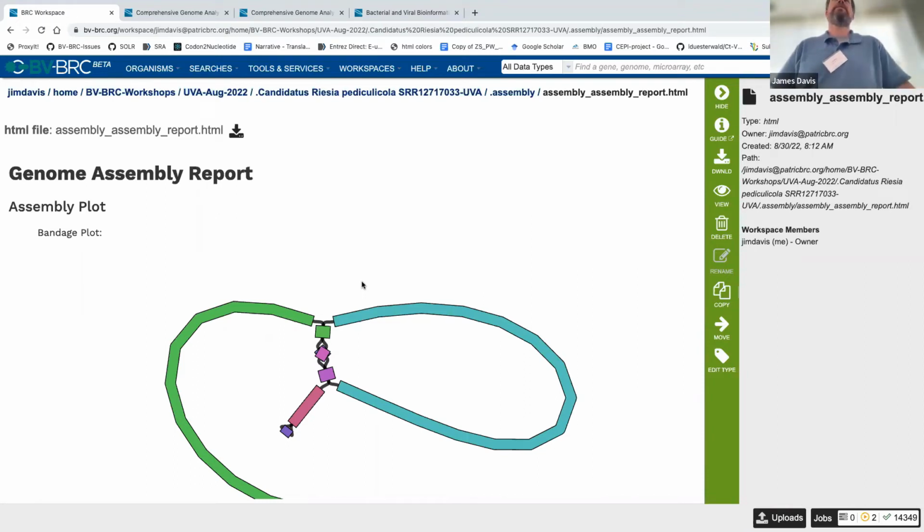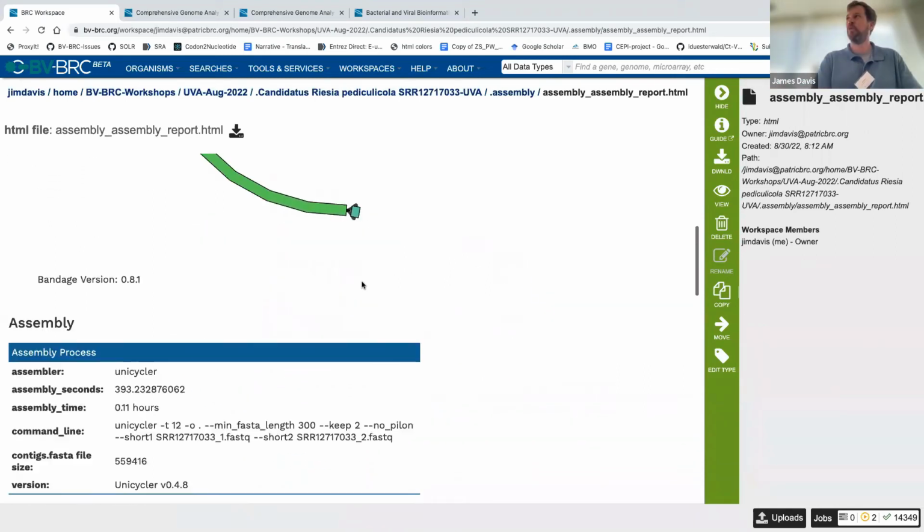It's something people have asked for years, and it turns out to be a tricky problem, machine learning wise, because plasmids are all different lengths but tend to be small, and chromosomes as contigs could be all different lengths, but tend to be large. So there's a little bit of work that has to be done to make that all work out.